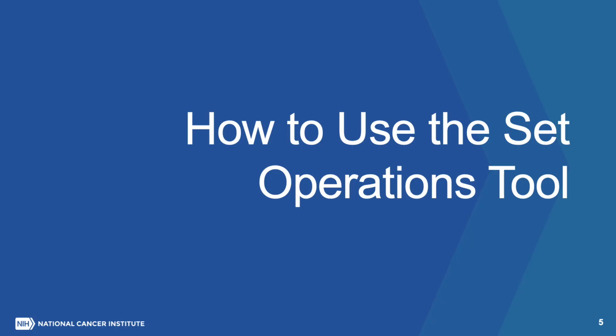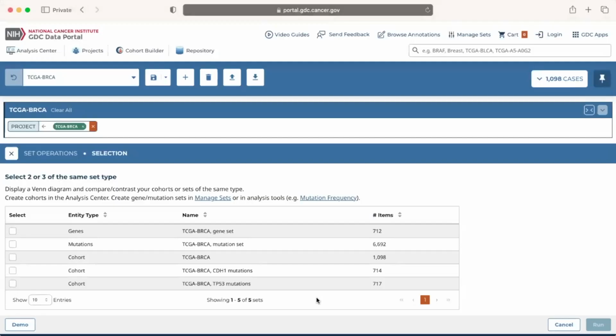How to use the Set Operations tool. When the Set Operations tool is launched, we have the option to select up to 3 of the same set types: cohorts, gene sets, or mutation sets. In the bottom half of the page is the Set Operations selection area, which lists previously saved cohorts, gene sets, and mutation sets. Note that before we can run the Set Operations tool, we need to have at least 2 sets of one set type already created.